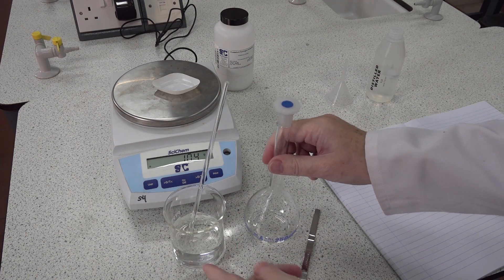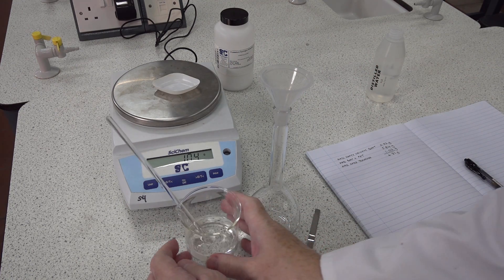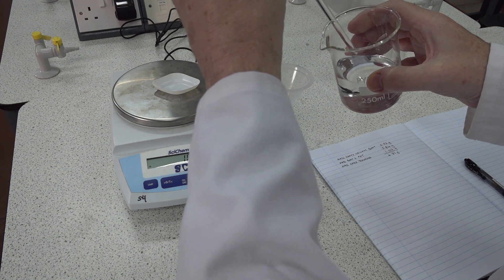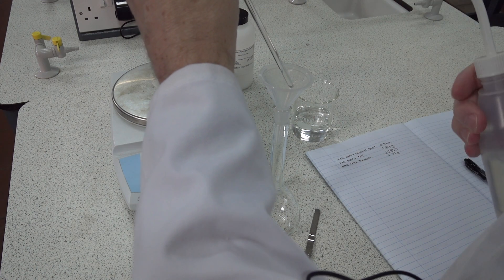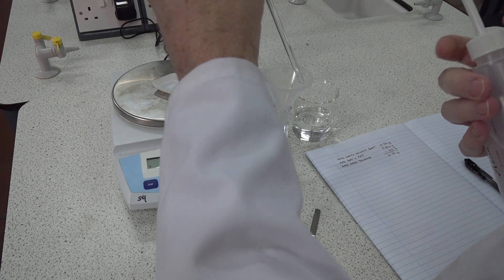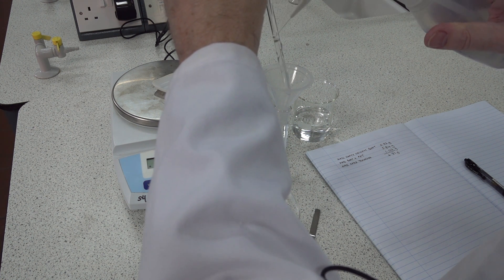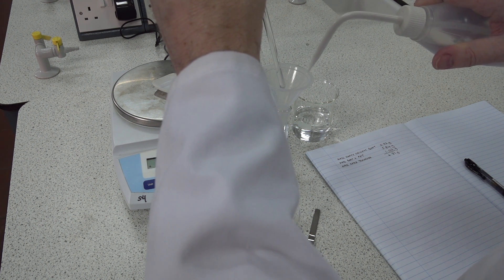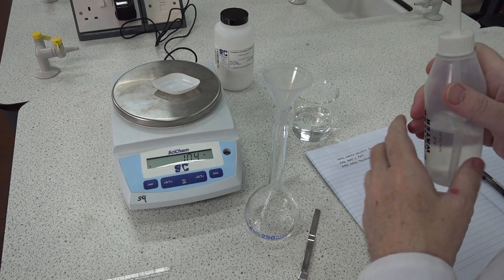The next stage is to transfer all of the solution into the volumetric flask. We use a funnel to assist that process, making sure that everything goes inside the flask — nothing is spilled outside, no drops, and we don't lose any of the material. What we might do to begin with is to rinse down our glass rod, which has got some solution sticking to it, before we put that down on the bench. Carefully rinse the glass rod, ensuring that all the solution is down and that any droplets on the funnel are rinsed down as well. When rinsing, it's important not to touch the tip of the wash bottle onto any of the glassware.